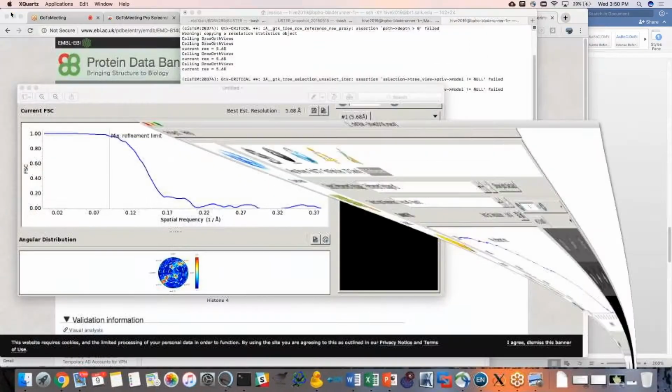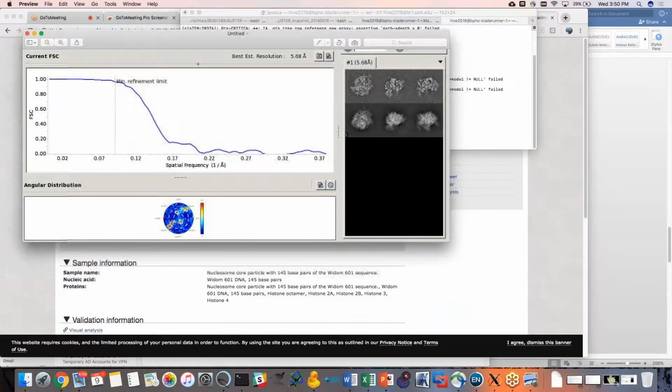So what I would argue was the winner from this is from computer 8, where I like the shape of this FSC curve a bit more, and the actual structure. This is reporting an actual resolution of 5.6 angstroms, which is maybe closer to reality, just looking at those densities that were coming out. And I guess one of the big takeaway points is don't always look at that resolution number it spits out. You always want to open your maps and make sure you're getting something reasonable.